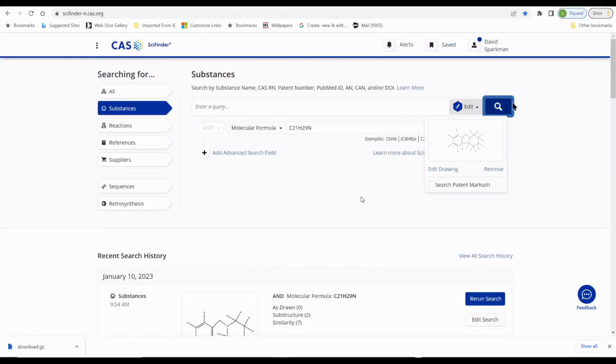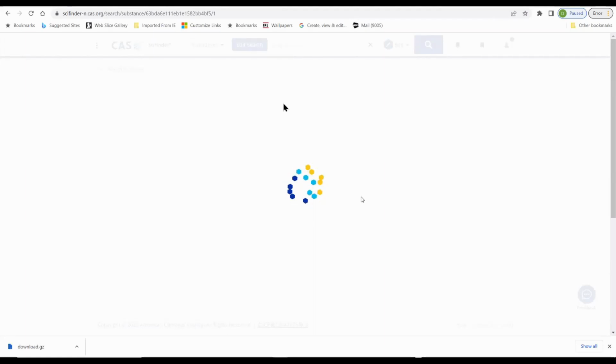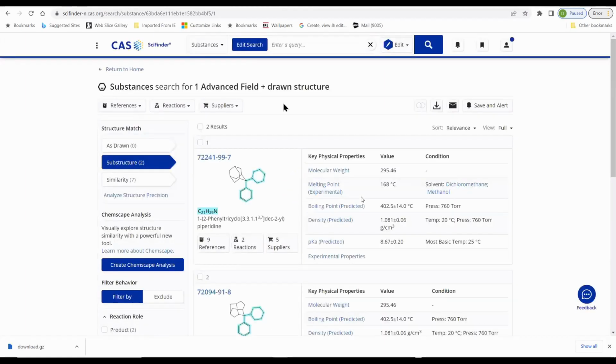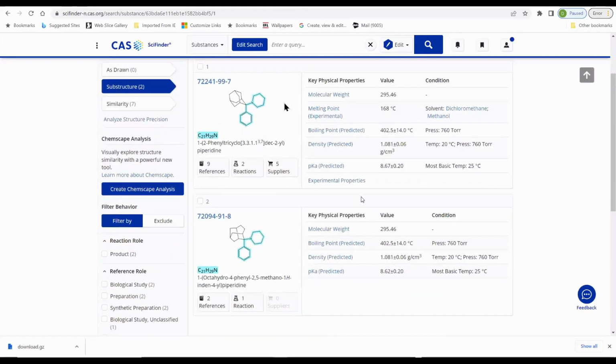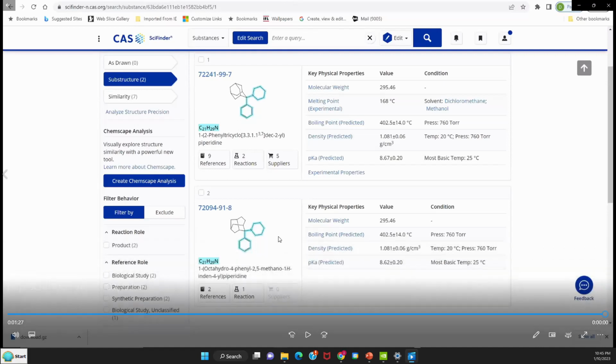So we go back, we've got our substructure now, we'll do the search where we'll search the molecular formula and we'll require it that it has that substructure and see what results we get. And you see you have two results that came up, and both of those results are the ones we got from the chemistry, and the one at the top is the desired structure, and the one at the bottom was the other second structure. There are actually three, but these are two of the three that I'd proposed, and as I said before, the top one is the correct one.